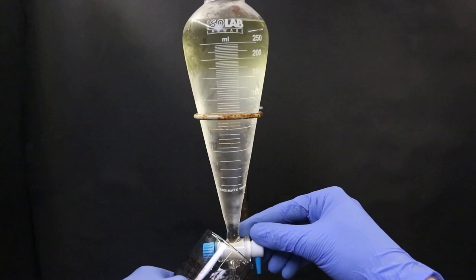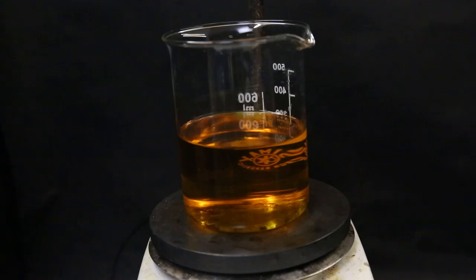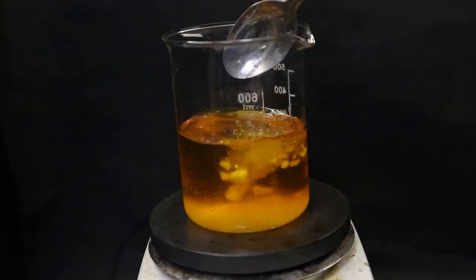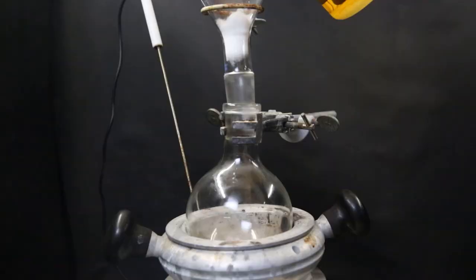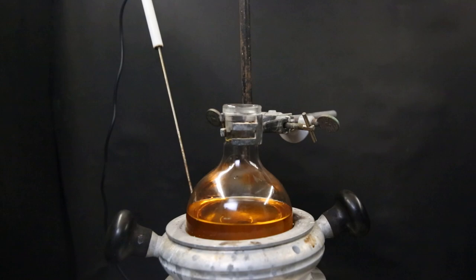I then combined the ether extracts with the pseudo-ionone layer and added in some sodium sulfate to dry it. After that, I filtered it all through some cotton directly into a flask. When that is done, I set it up for a distillation to boil off all of the ether.